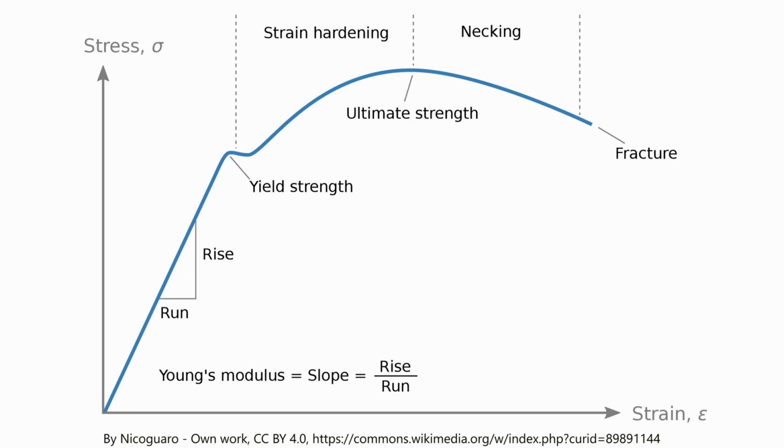This curve provides design engineers with a long list of important parameters needed for application design, failure analysis, and quality control. A stress-strain graph gives us many mechanical properties such as strength, toughness, elasticity, yield point, resilience, elongation during load, and the modulus of elasticity.